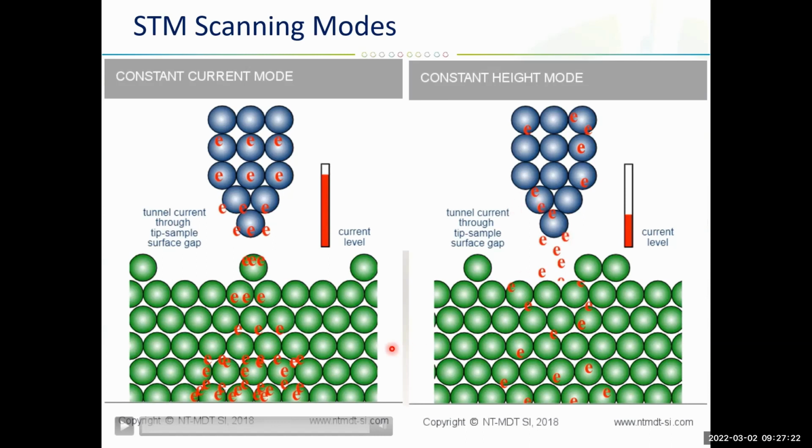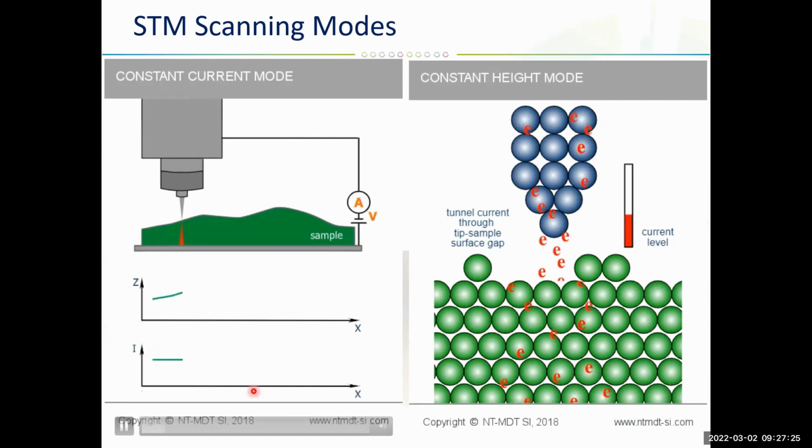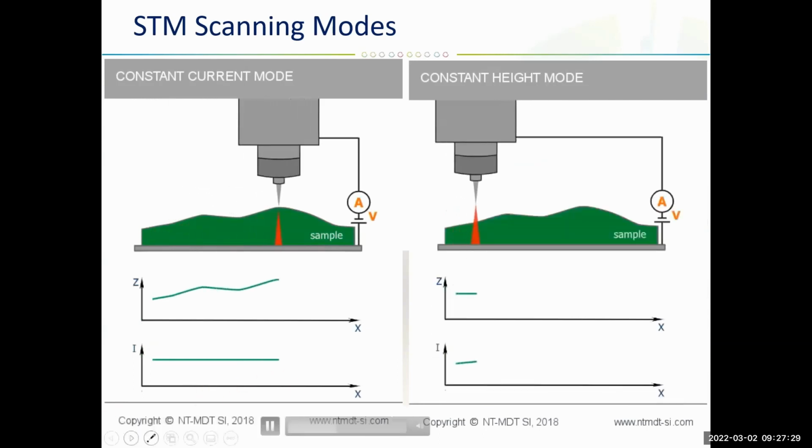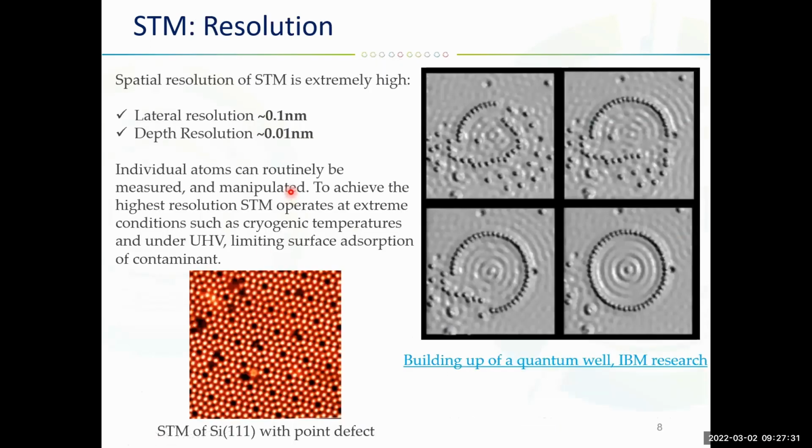So talking about resolution. The spatial resolution is high, it's atomic scale.